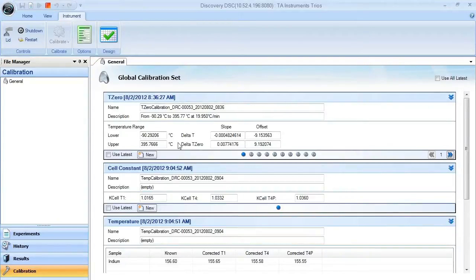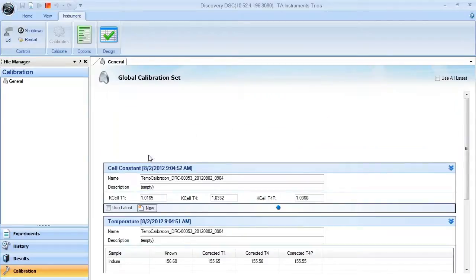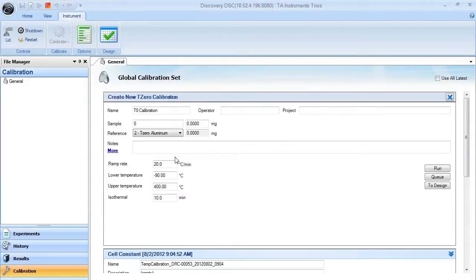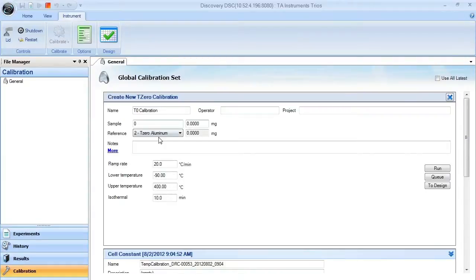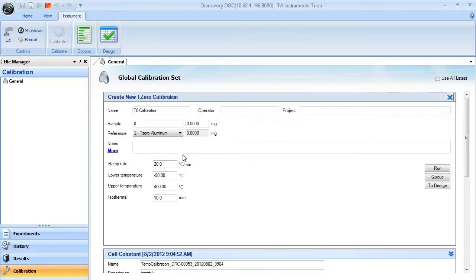If you're going to set up a new T0 calibration, just make sure that you hit the New button, and you'll be prompted here to enter in various information about the sapphires that you're going to be using, as well as the temperature limits of your DSC. Make sure that you find your red and your clear sapphire for T0 calibration.